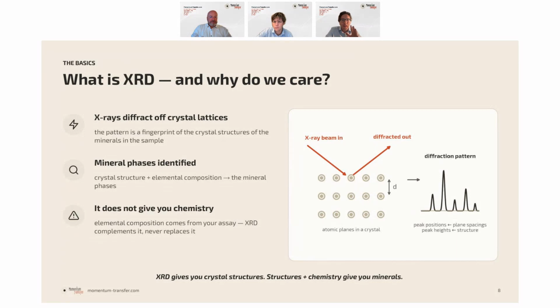X-ray diffraction works in a very simple manner. It's a wonderful probe for the structure of your materials, and it works a bit like you see in the diagram. There's a two-dimensional representation of a crystal lattice. The diffraction effect is a very simple, basic combination between reflection and interference, and it causes one crystal structure to have a very clear diffraction pattern, which you can interpret as a fingerprint of the microstructure and crystal structure of your material.